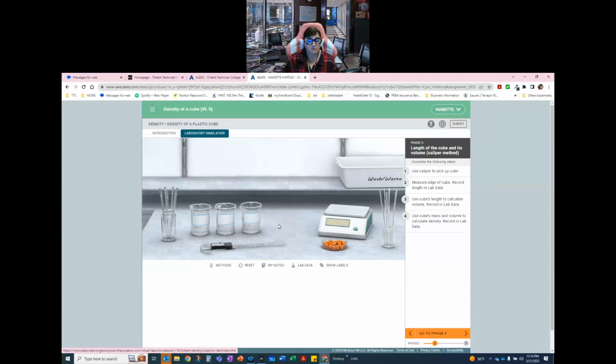And from time to time, we have to do that, especially when we're talking about the density of a liquid, because we can't take the density of a liquid and measure its mass and its volume very easily. So we need to be able to find other ways to deal with that. So that is one of the things that you'll be observing when you do this particular experiment.